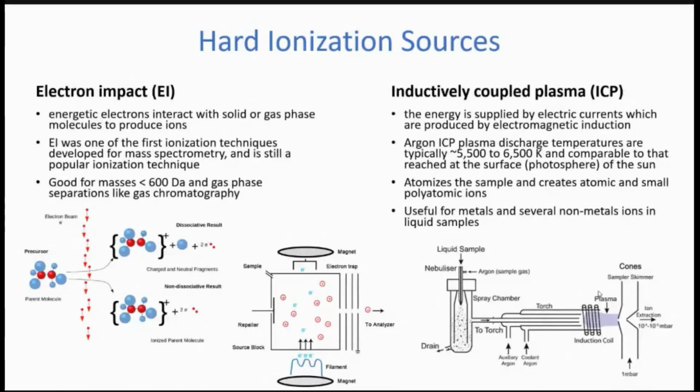So now your sample is mixed with this gaseous plasma argon, and then your sample goes through these cones that draw the pure ions into the mass spectrometer, and usually argon's going in too. So often you can get interferences from your gas, and there are a few other gases that are occasionally used in ICP if something you're measuring will completely overlap with argon adducts or things like that. Anyway, we can talk about that another day.